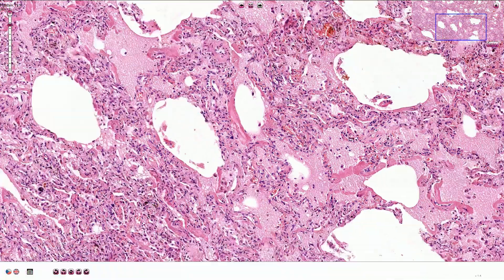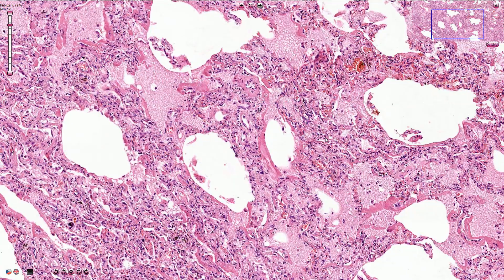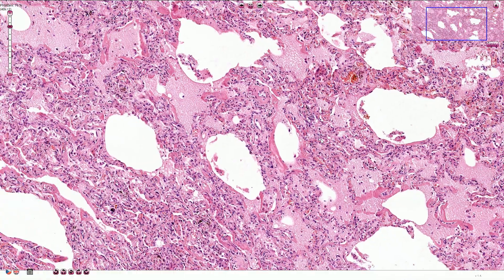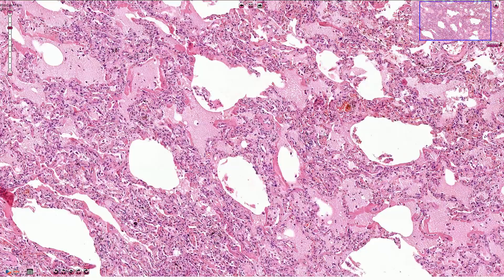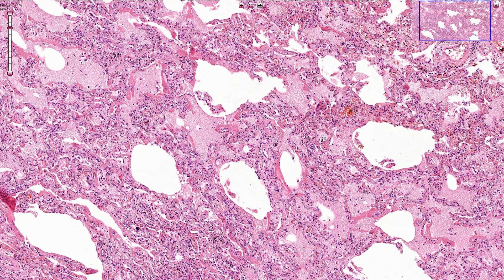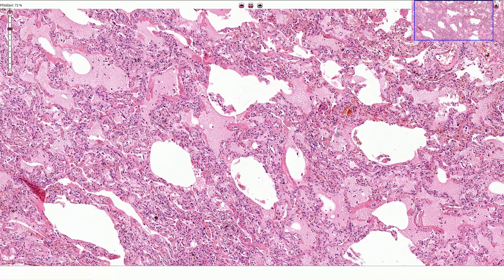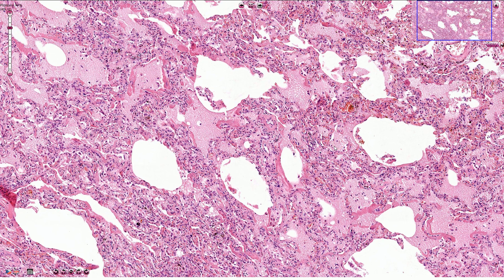Over time this acute phase will lead to proliferation of fibroblasts and formation of granulation tissue, and if the patient survives it can lead to honeycomb lung. Some milder cases can lead to complete resolution, especially if the type 2 pneumocytes are preserved. This is the picture of the acute phase of diffuse alveolar damage, or clinically called ARDS or acute respiratory distress syndrome.